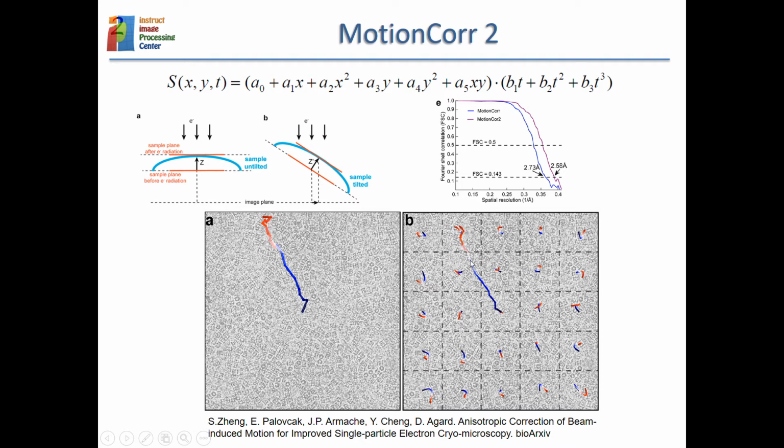And here is a summary of what is the global trajectory, but this global trajectory can also be decomposed into local movements of the different regions. And why you may have different movements is because this doming causes the different regions to behave differently if you are in one of the corners or in the middle, and this is especially true if you have a tilted sample.